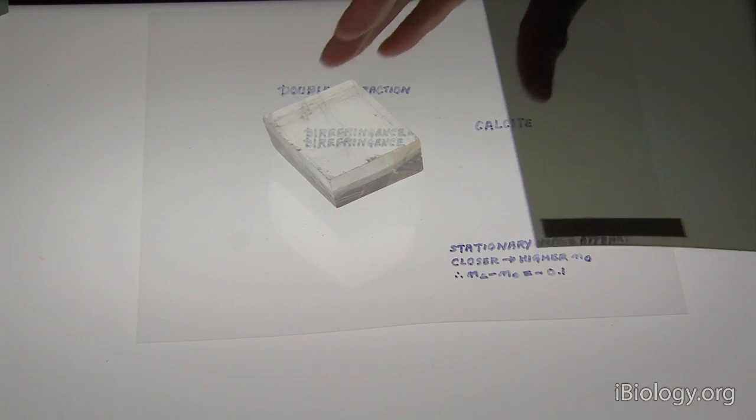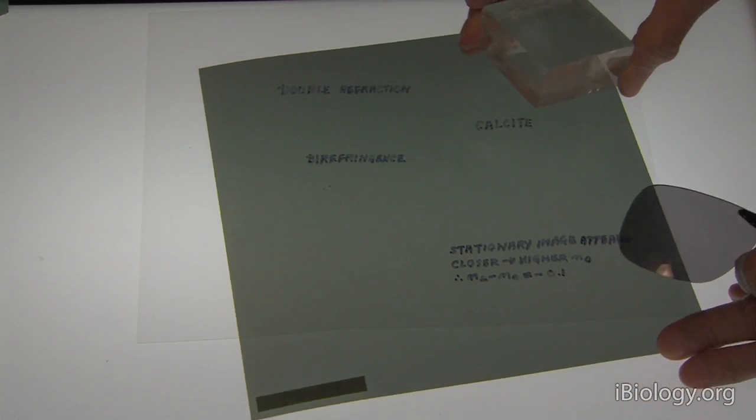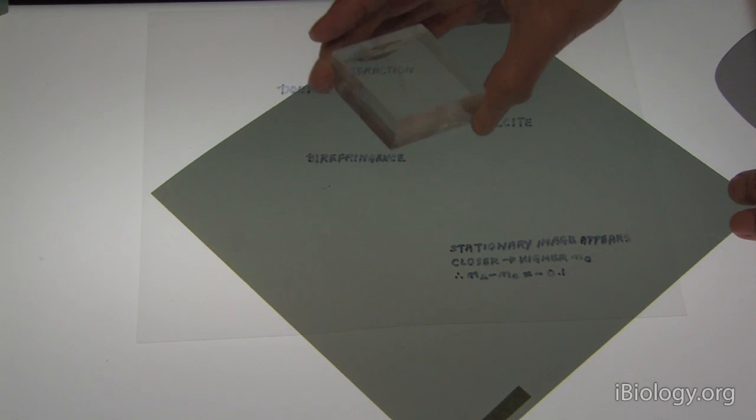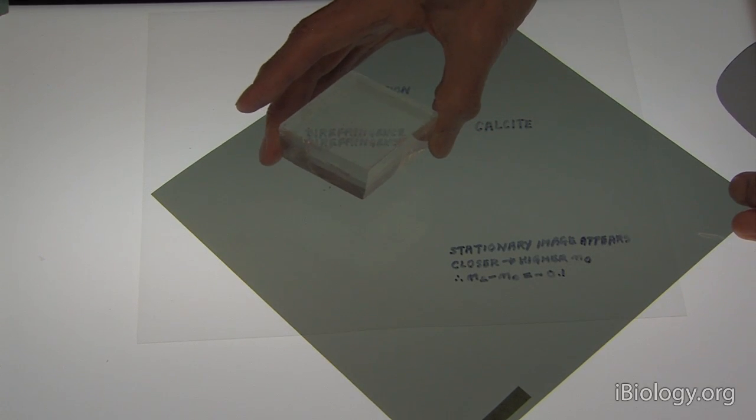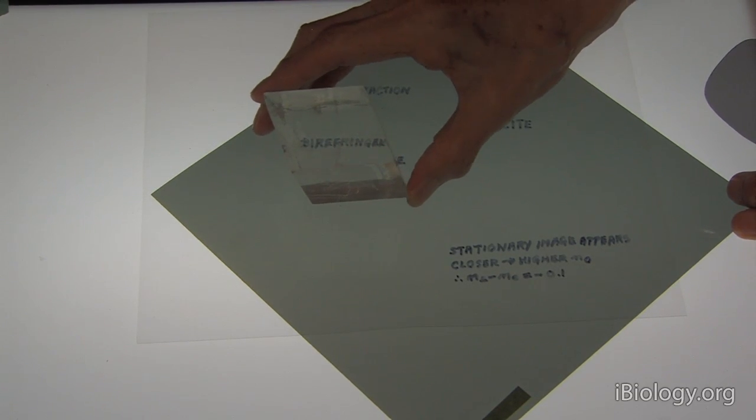So now, what we're going to do is take two polarizing materials. Here is the polarizing material I'm putting under the crystal. And depending on how I set the crystal, we should be able to see two images.